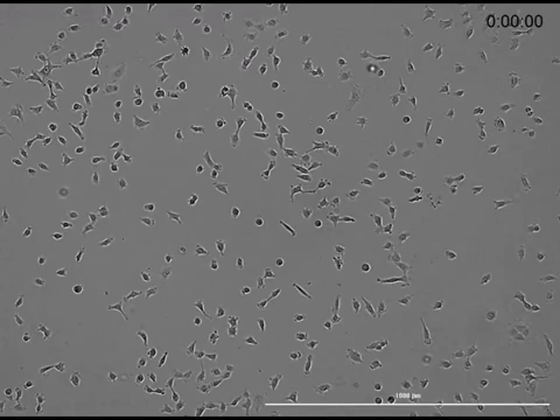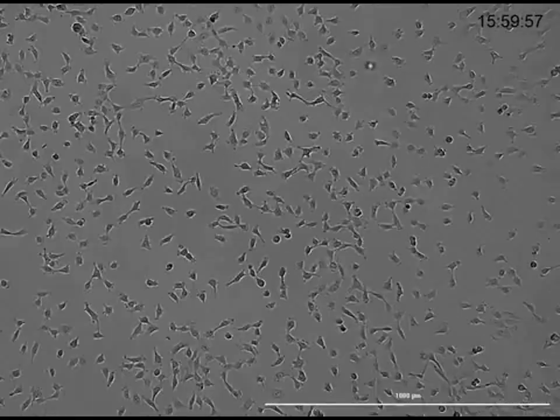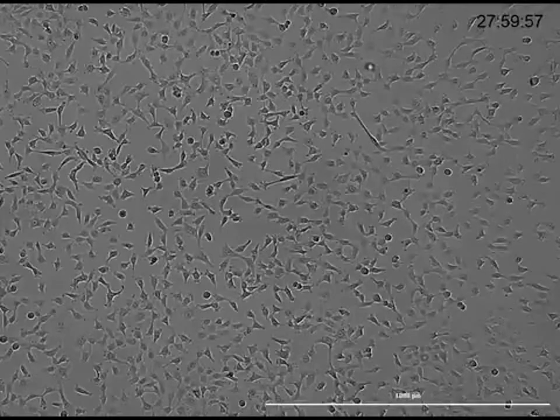Now, as seen in this video, untreated HT1080 cells exhibit robust proliferation within this controlled environment, and the collected images provide a very detailed record of the entire experiment for future reference.